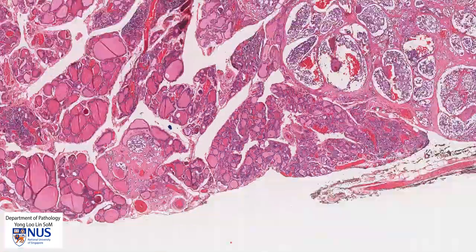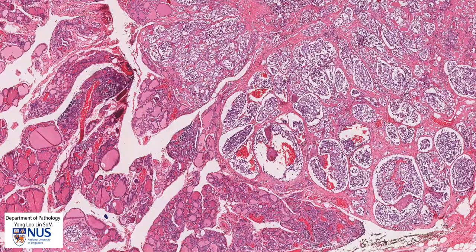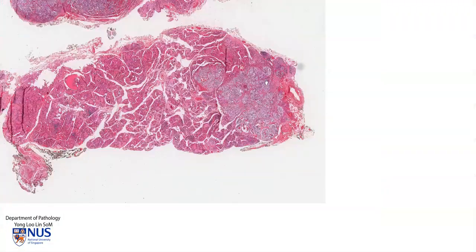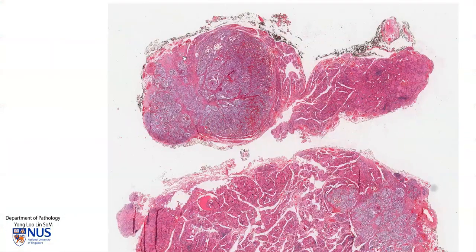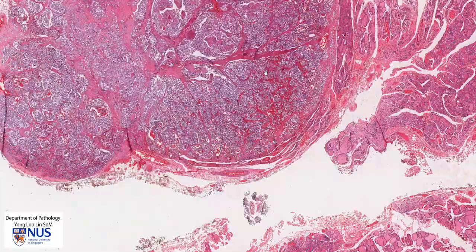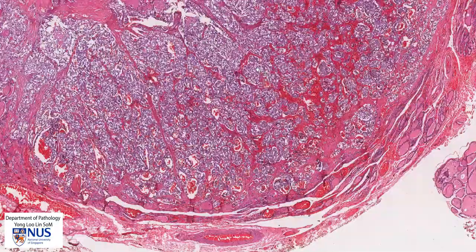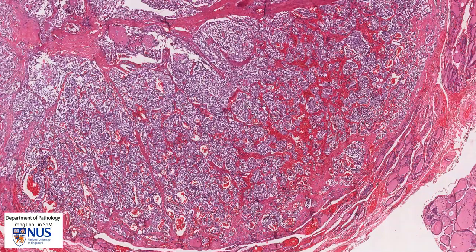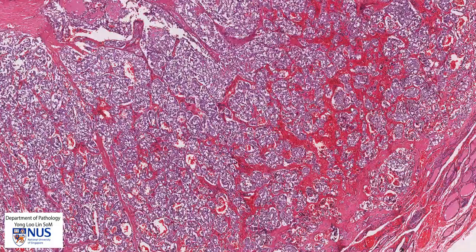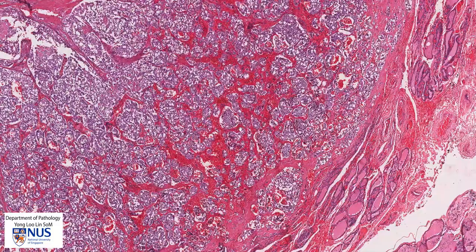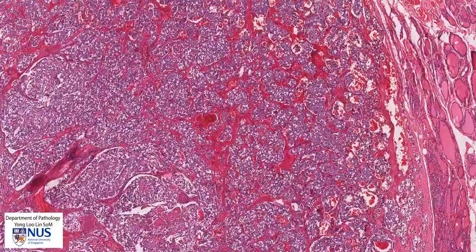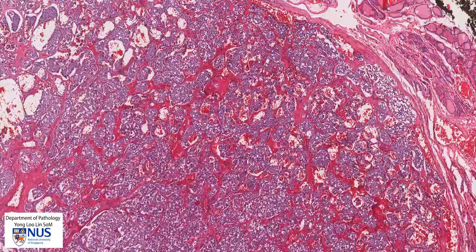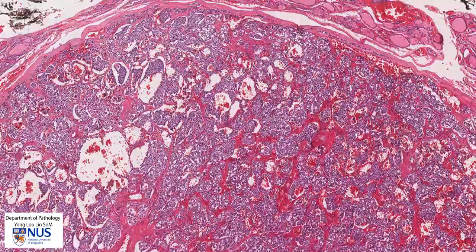Now let's take a look at the tumor, and this is better seen in the other section here. On low magnification we can see that the tumor appears to be quite circumscribed in some areas.